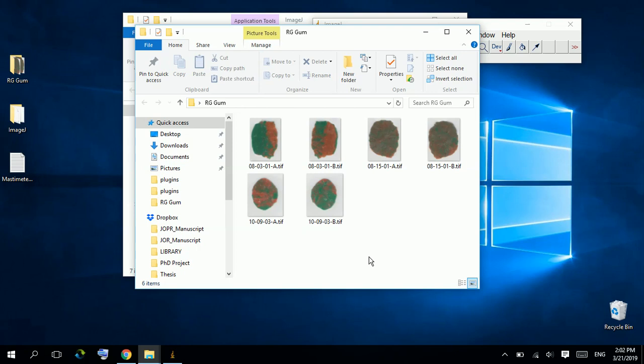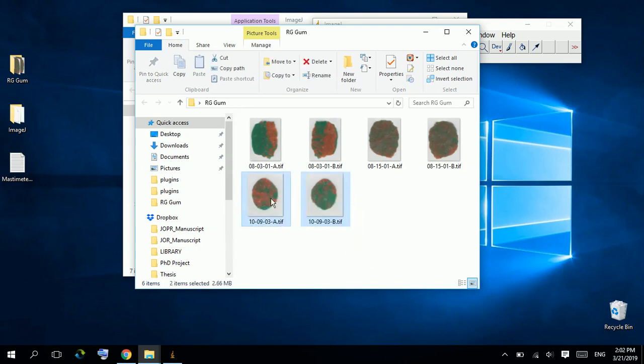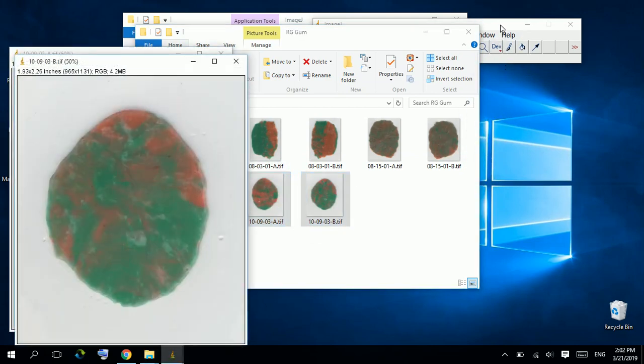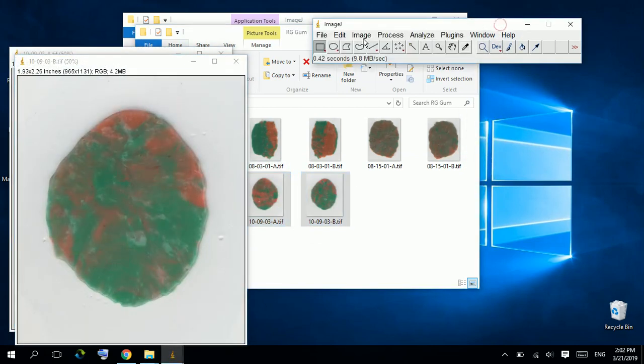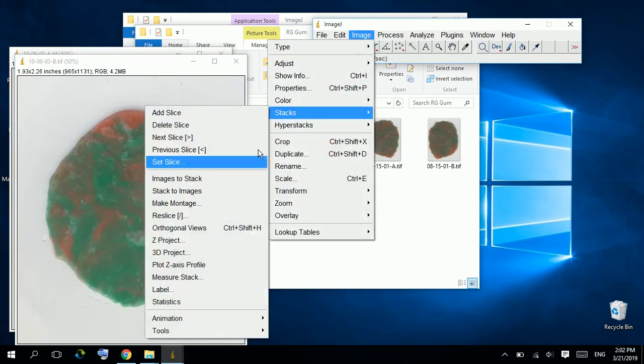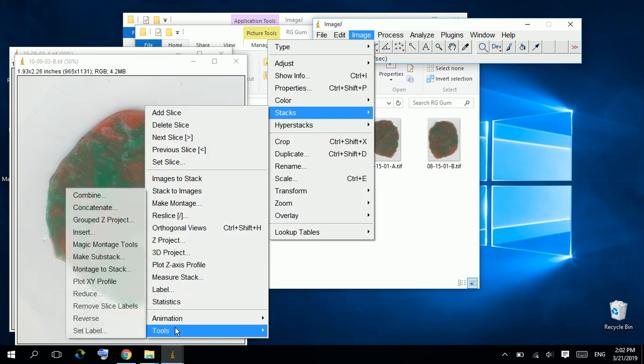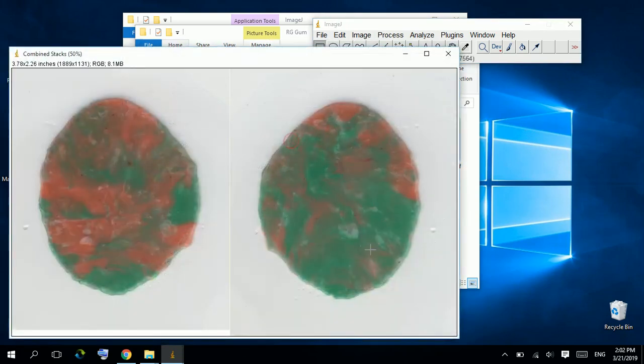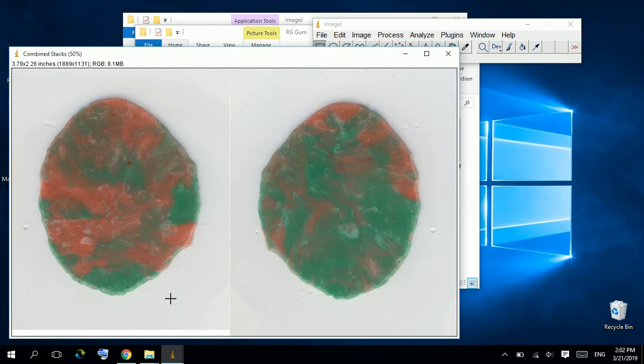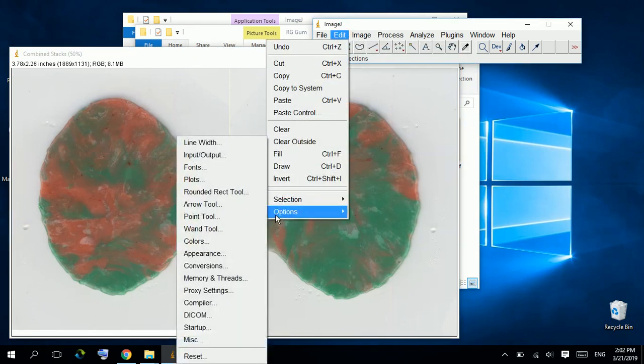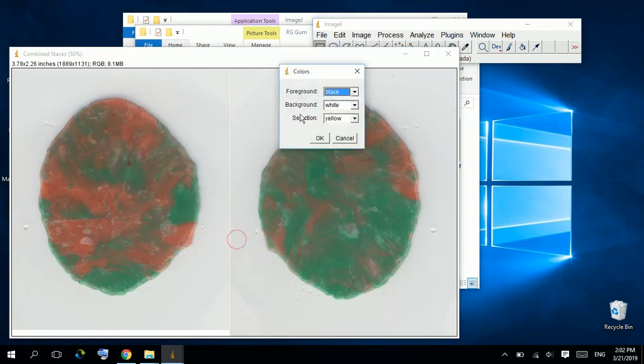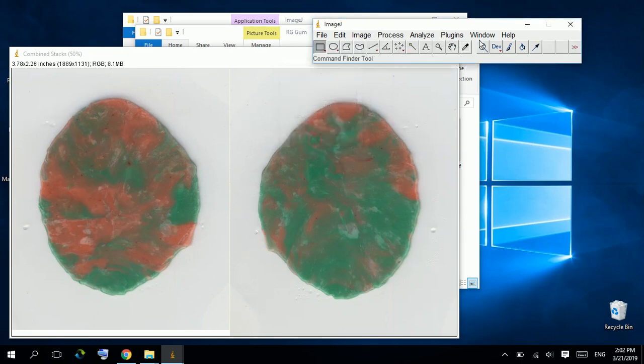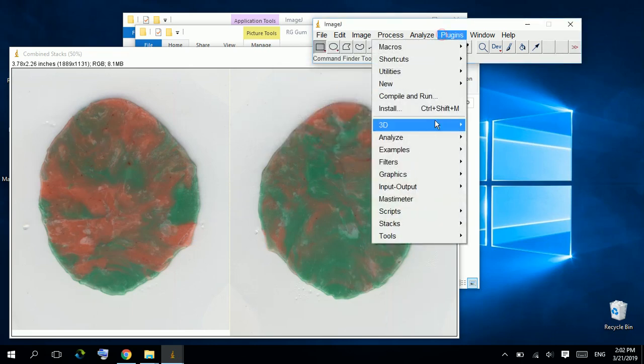I will take two sides of one specimen using Image Stack Tools Combine. Extra area should be white. You can edit the background color from Edit Options Colors Background. Run Plugins Mastimeter.